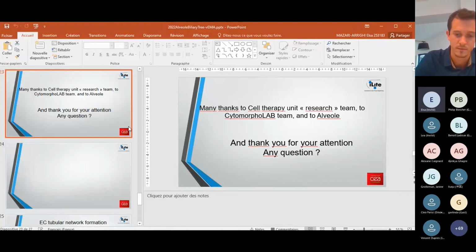What we are doing is providing a relevant cellular microenvironment, so the cells can behave like they normally do in vivo. For this application, we want lumens that are totally empty, so the cells are able to drain out the initial hydrogel completely. We are looking for cells that are able to remodel and change the gel.